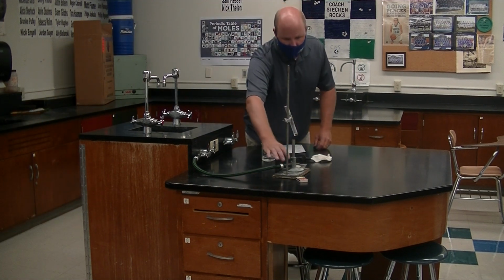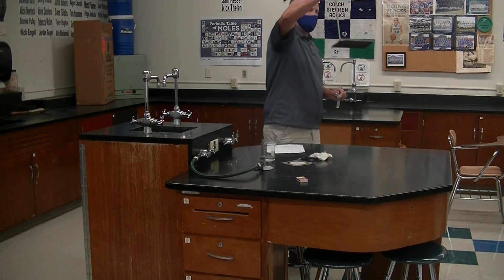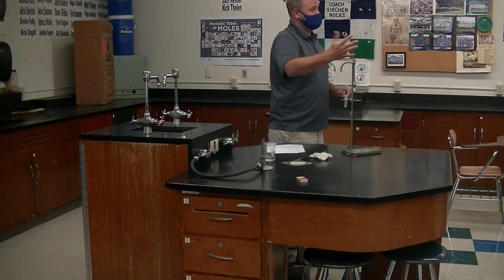Some stuff set up. Once again, some more equipment review before we get going. Alright, this is something you've probably never seen before, and definitely don't know the name of. This thing's called a ring stand. It's a stand that holds a ring.